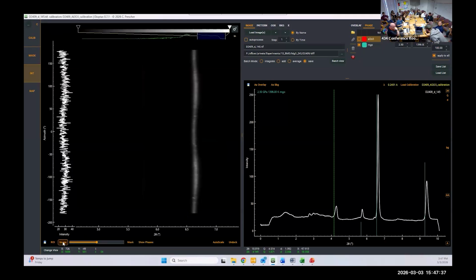So we can just look at the d-spacing of these peaks. 2 theta and d-spacing are inversely proportional to one another. We're going to fit a peak across all these things, and they're going to make this profile. So when we fit all our peaks around this circle, we get a profile that looks like that, and then we fit this profile. And from there, we can actually get what the differential stress is. Did that make sense to people?